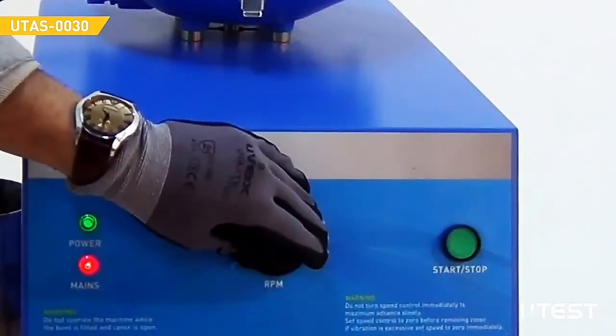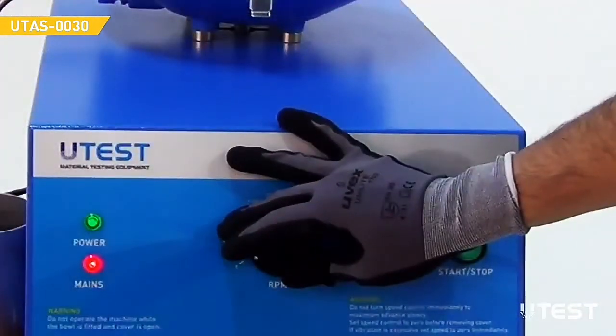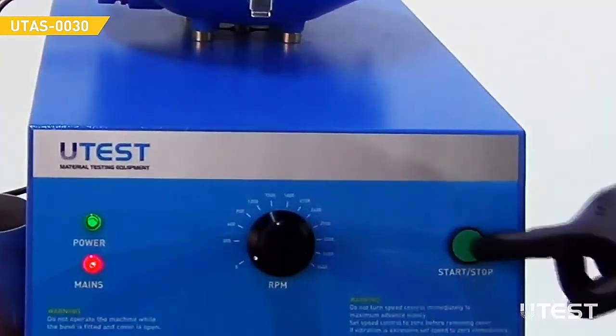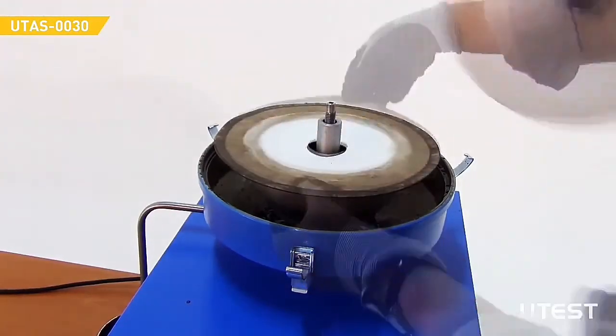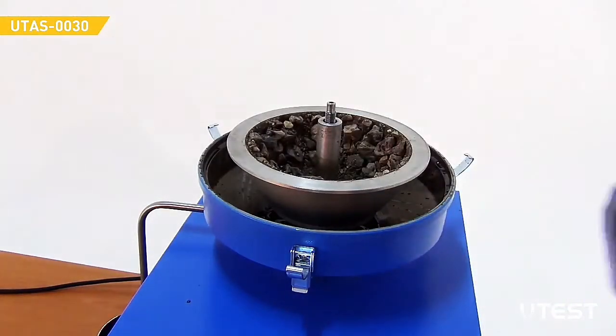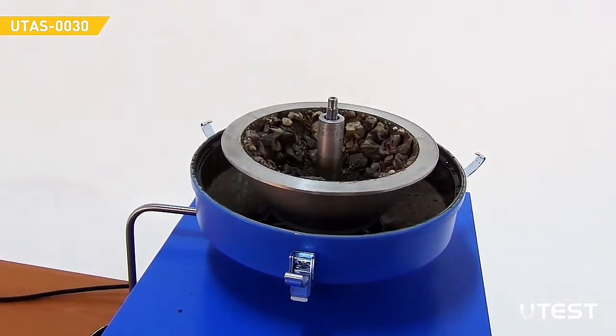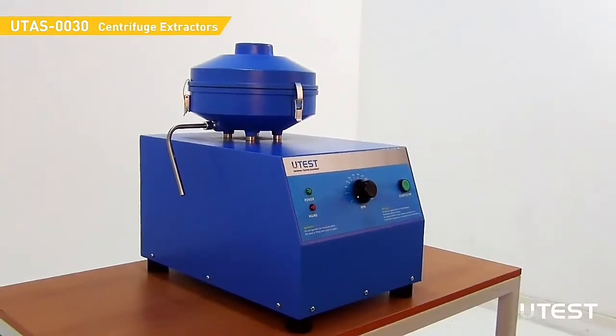Turn the speed control knob to the initial position and press the start-stop button. Add 200 ml of solvent into the asphalt mixture and repeat the whole operation once again to ensure that the bitumen has been completely extracted. The extracted solution can be recovered by using UTAS 0040.